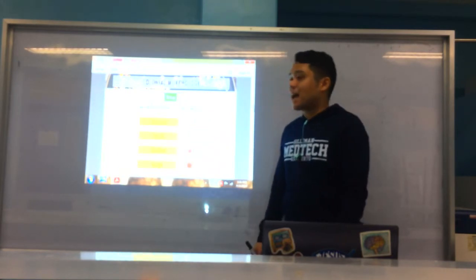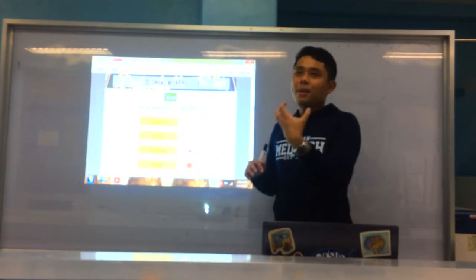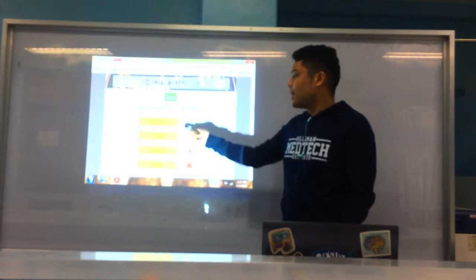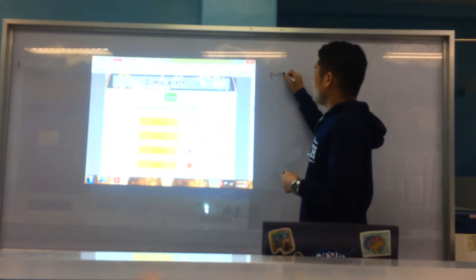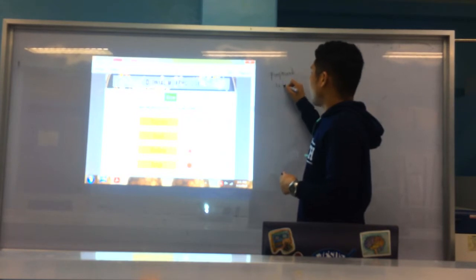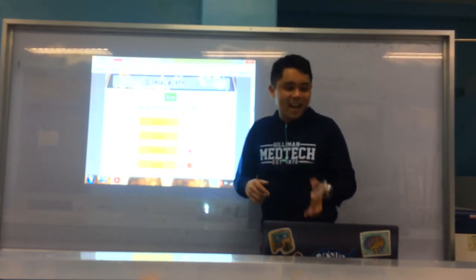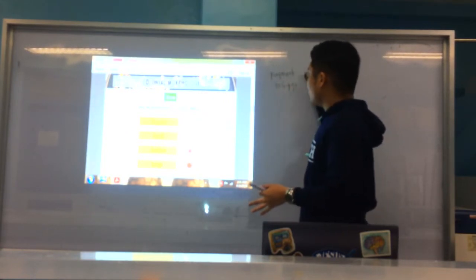Next, we talk about size. It can be measured in mm or you can just estimate, like looking at it subjectively, based on how you see it. The smallest is pinpoint. Usually, pinpoint colonies, if I'm not mistaken, are S. pyogenes. Your colonies of S. pyogenes are pinpoint gray beta hemolytic colonies, I think. Then small, medium, and large.